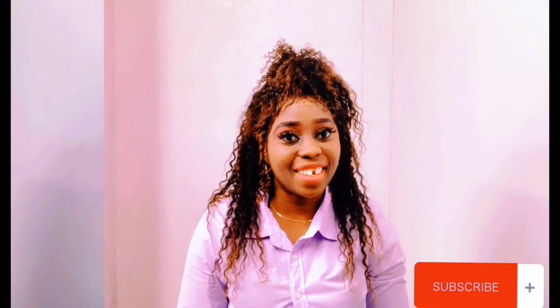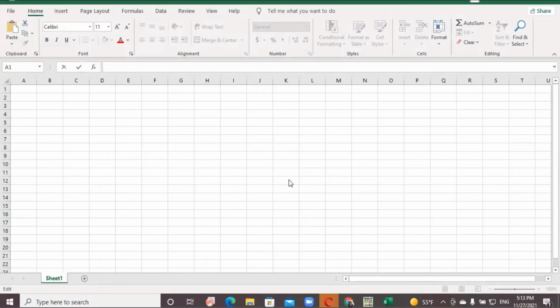Today, you will know how to use ImageJ software to measure the average particle grain size. Let's get started. First, you need to open the ImageJ software. I downloaded mine and saved it on desktop. In my previous video, I already showed how to download ImageJ software.